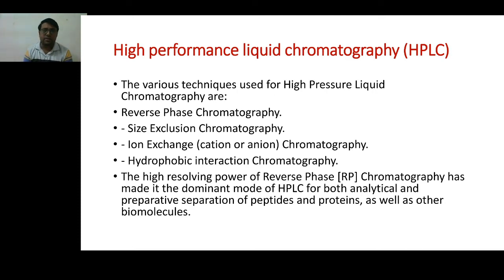The high resolving power of reverse phase chromatography has made it the dominant mode of HPLC for both analytical and preparative separation of peptides and proteins as well as other biomolecules. Among these, we are going to discuss here reverse phase chromatography and normal phase chromatography.